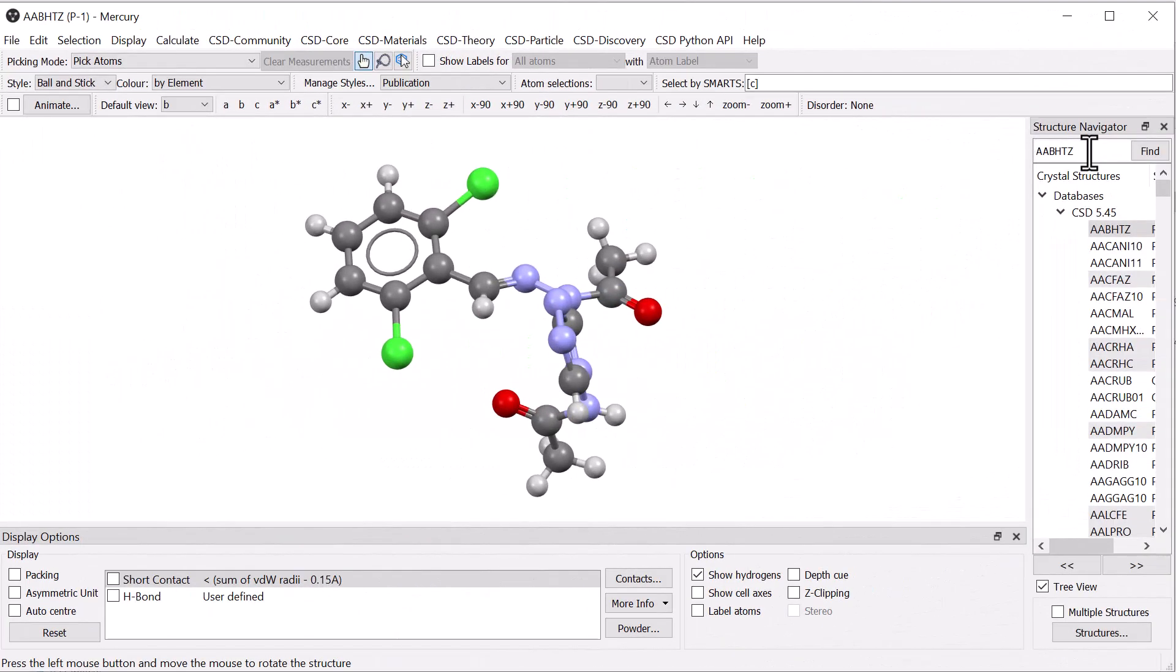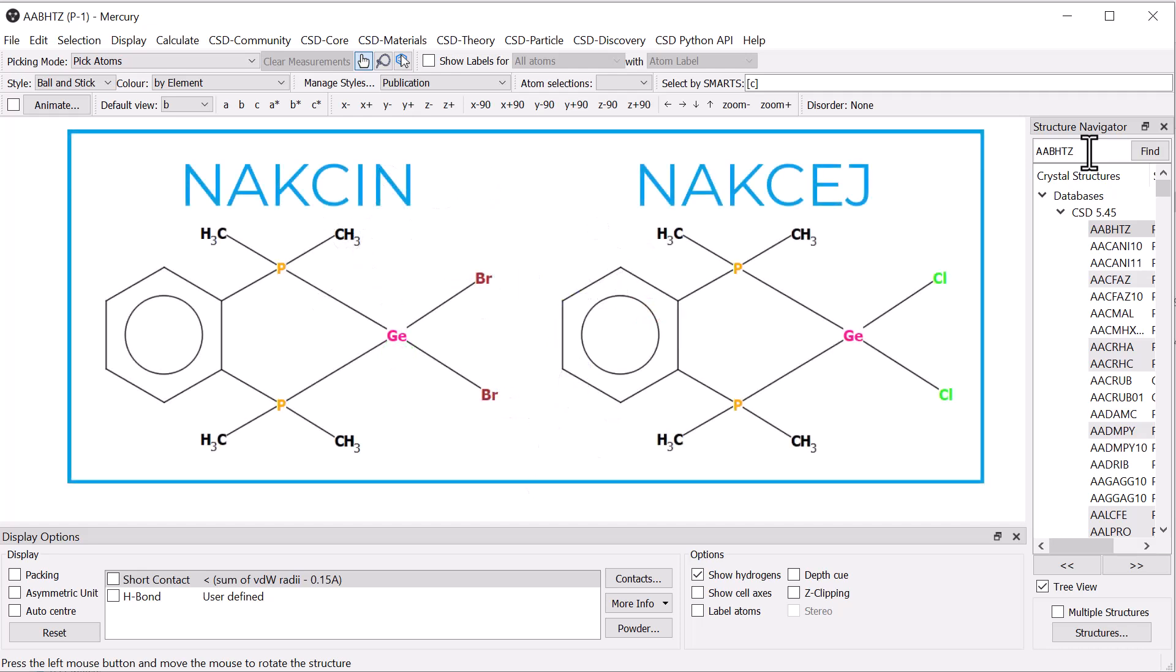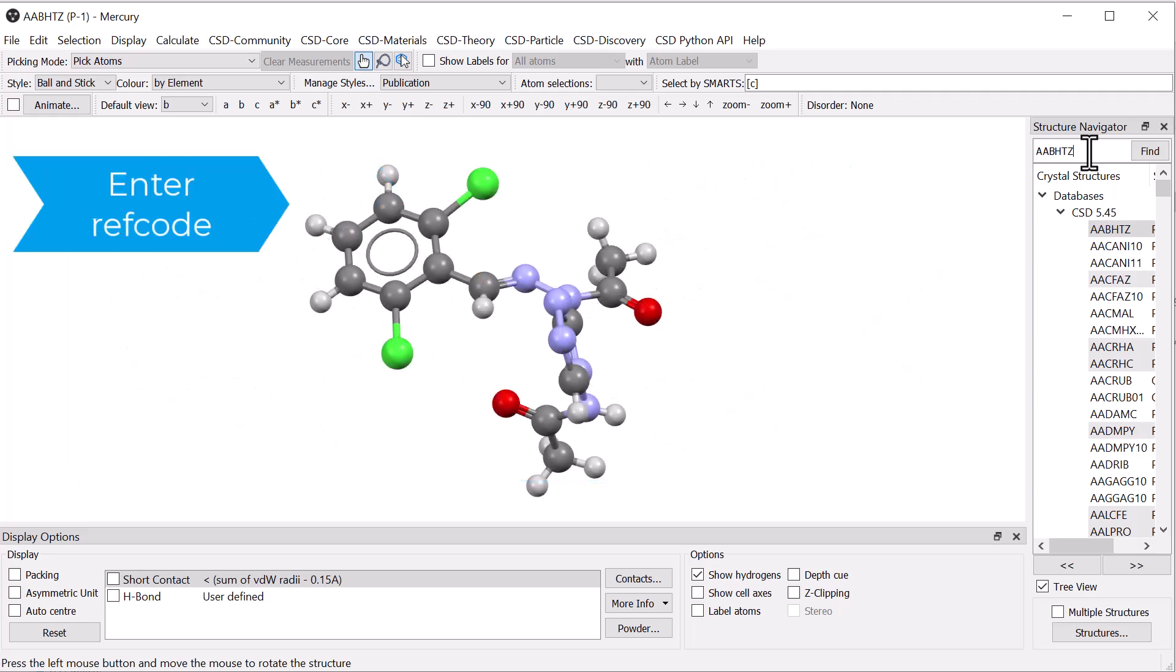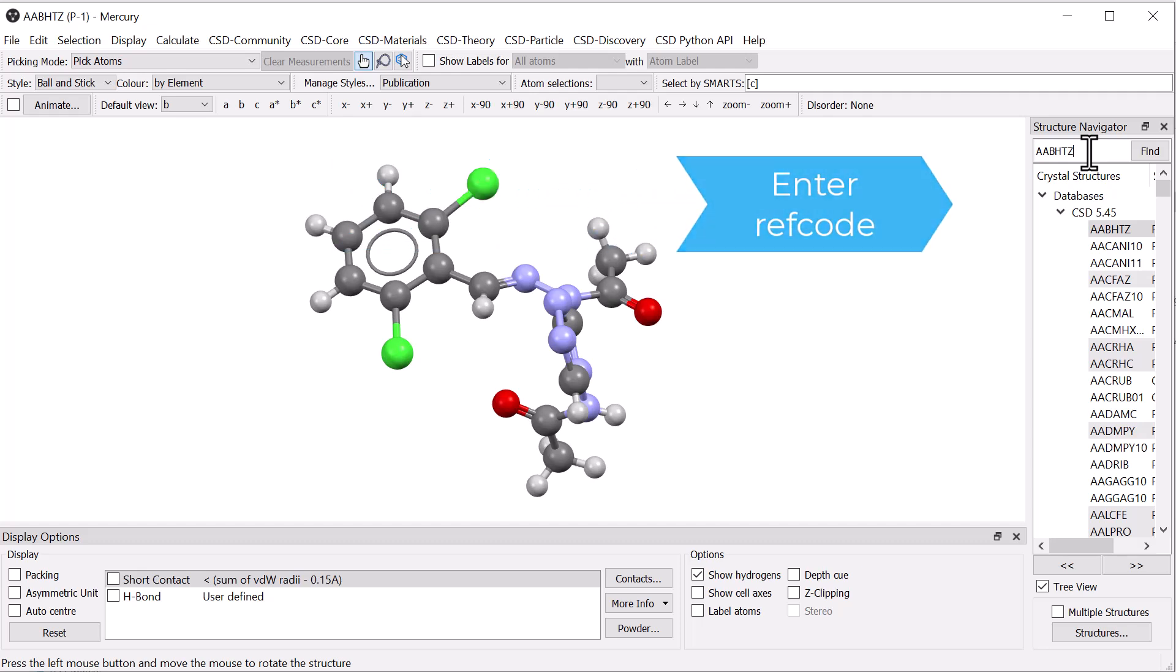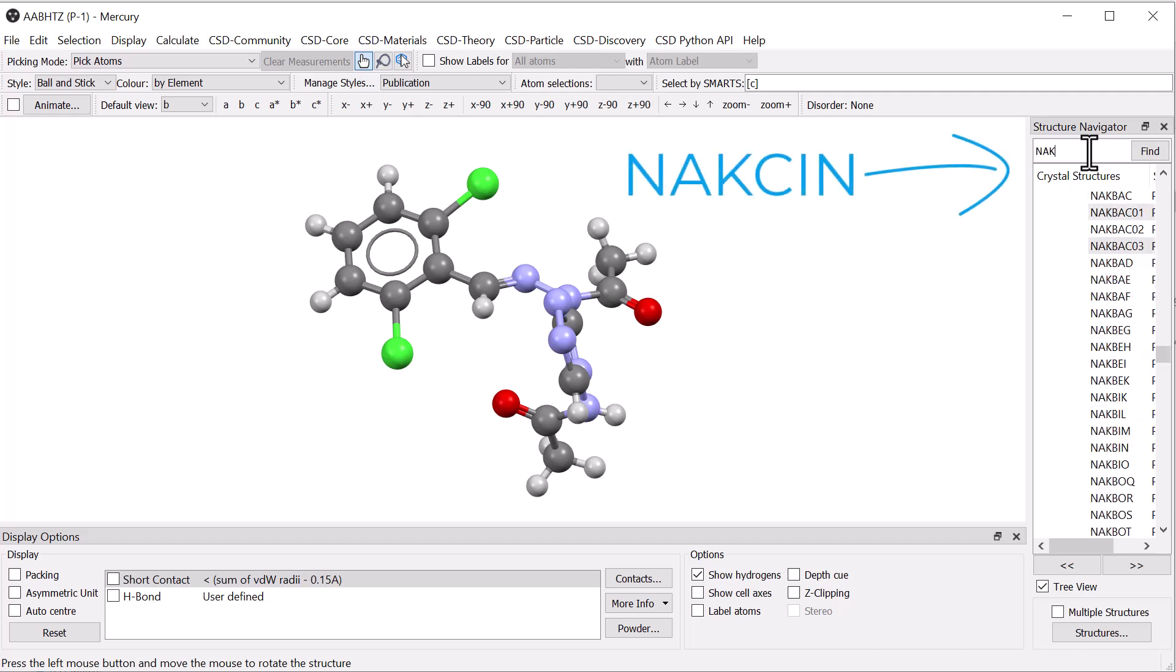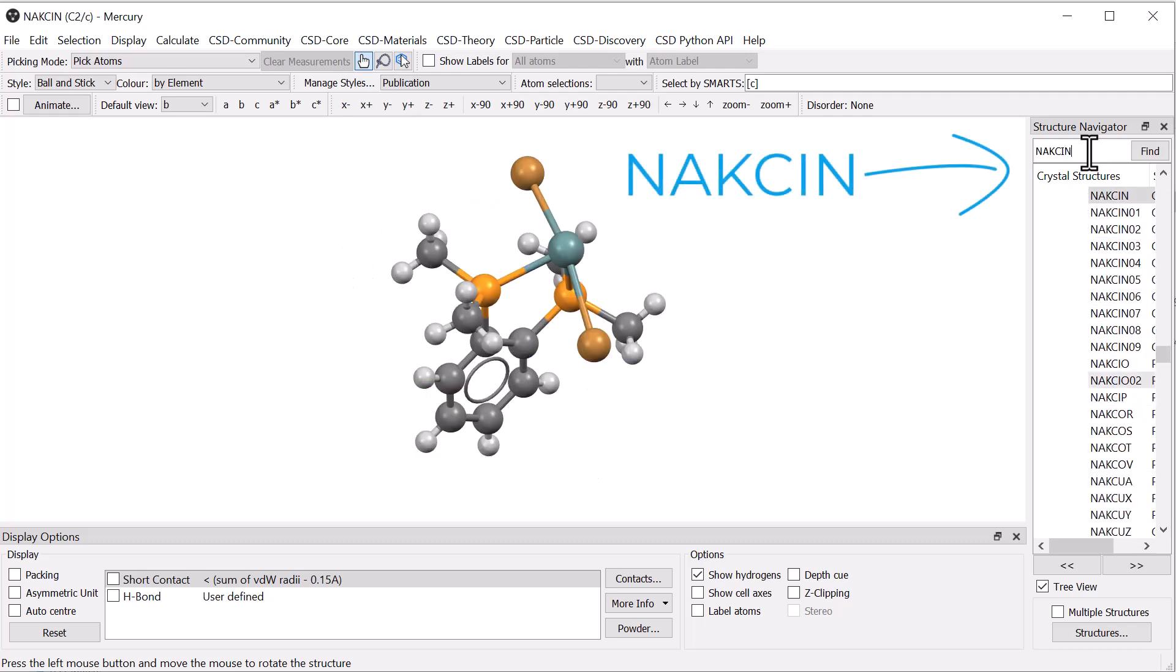We will compare the structures of two related germanium compounds with CSD ref codes NAKCIN and NAKCEJ. To start, type the ref code of one of these structures in the structure navigator. Here we will use NAKCIN.